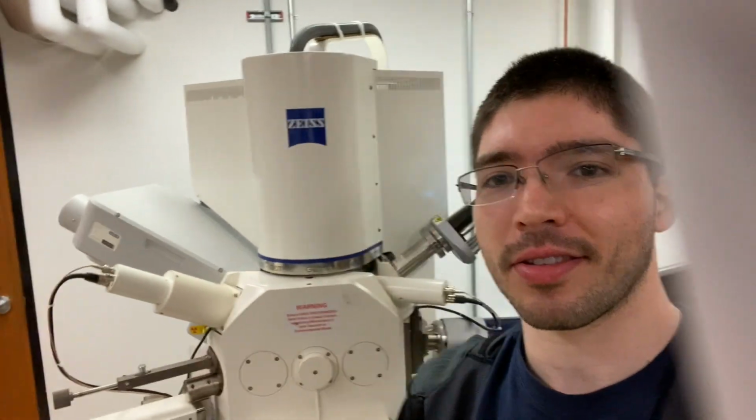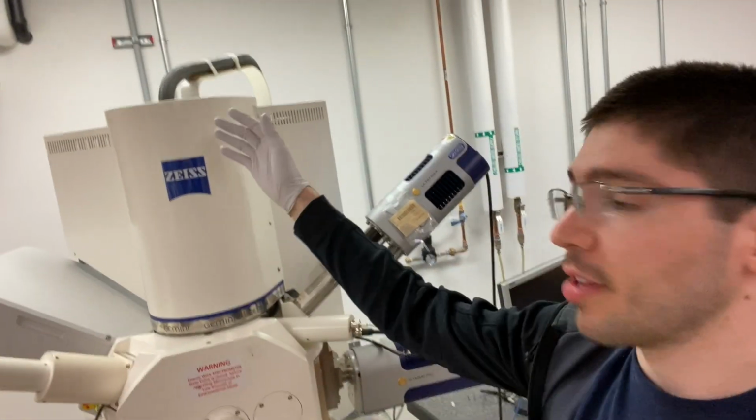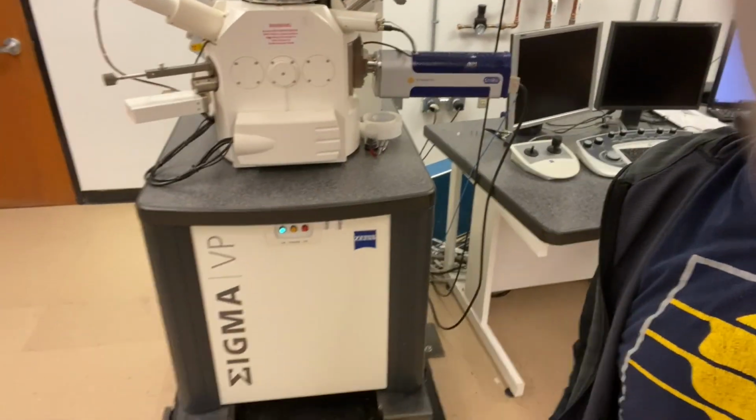And for everyone wondering about the SEM, it looks just like this, so you can see. Let me do this again. So you can see this is what it looks like. It's not a very large instrument per se, but it sits on this platform right here.